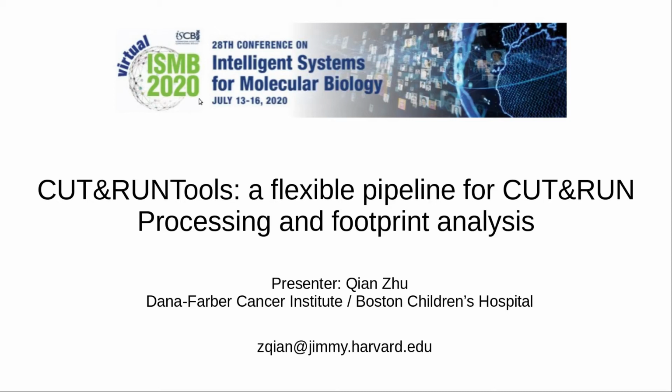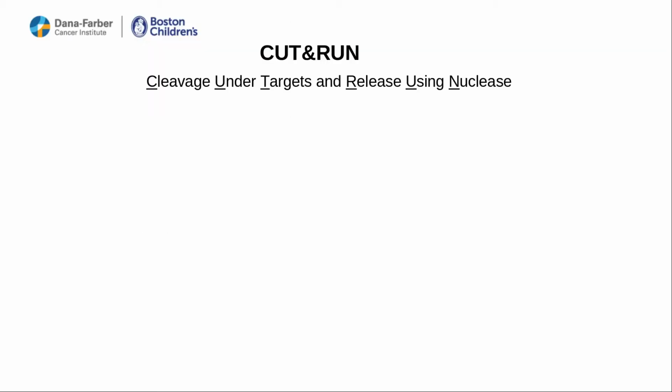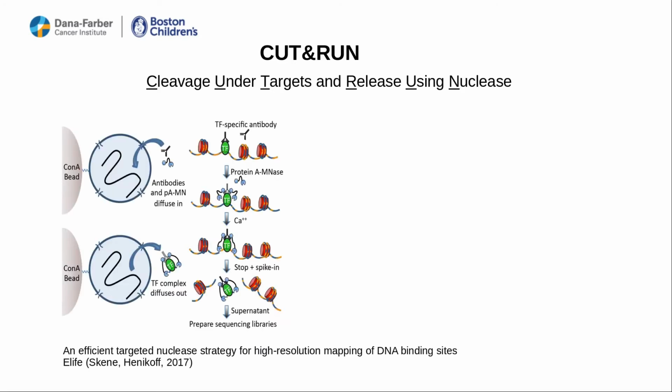Today I'm presenting my poster, CUT&RUN Tools, a flexible pipeline for CUT&RUN processing and footprint analysis. CUT&RUN is a protein-DNA mapping technology. It stands for cleavage under targets and release using nuclease, and this technology was developed in the lab of Henikoff in 2017.